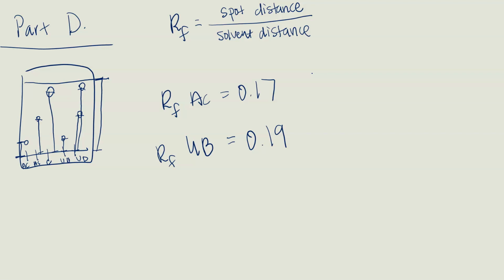Okay, and then for number 8, it'll say components in unknown, and then I would write D. And then below that, I'm going to write what things I think are in it. The things you think are in it are going to be acetaminophen or aspirin or caffeine. You could have 1 or 2 or 3 things in your solution. Then you're going to go to the next page where you're supposed to get it from your partner group, and you're going to redo everything. Everything works the same way. The distances should have been measured in the lab, and then you're calculating RF values for all of them, showing your calculation, and then deciding what chemicals are in each of the unknowns and recording that.